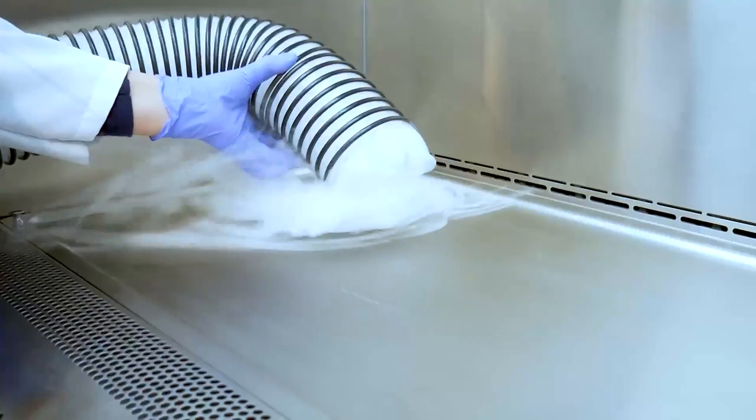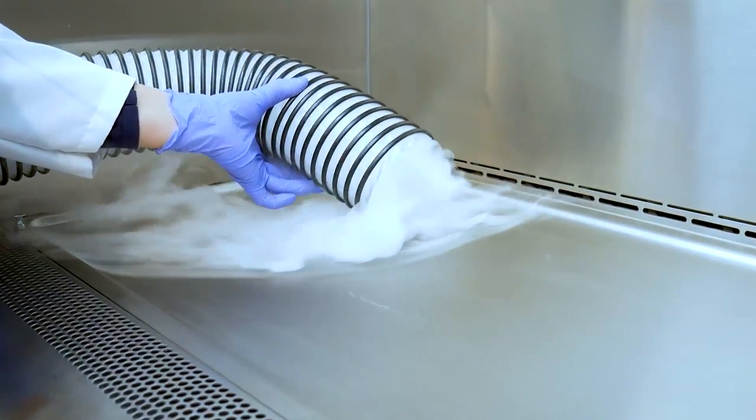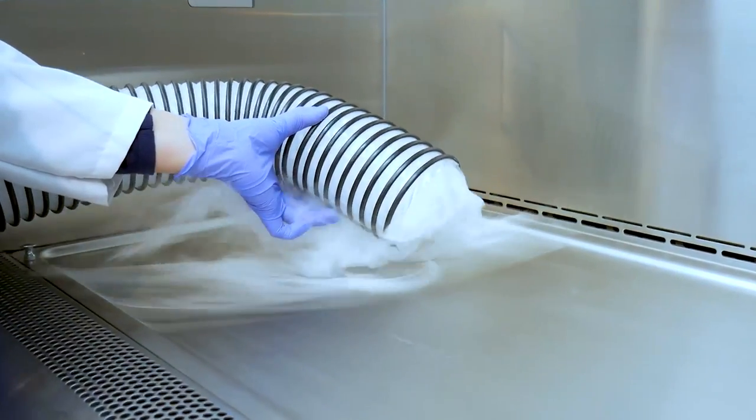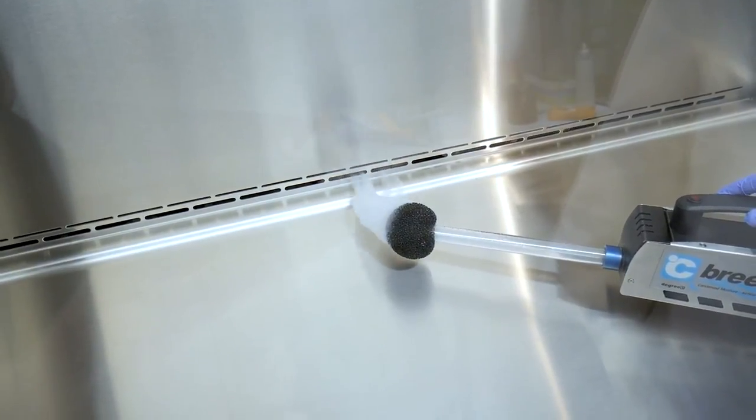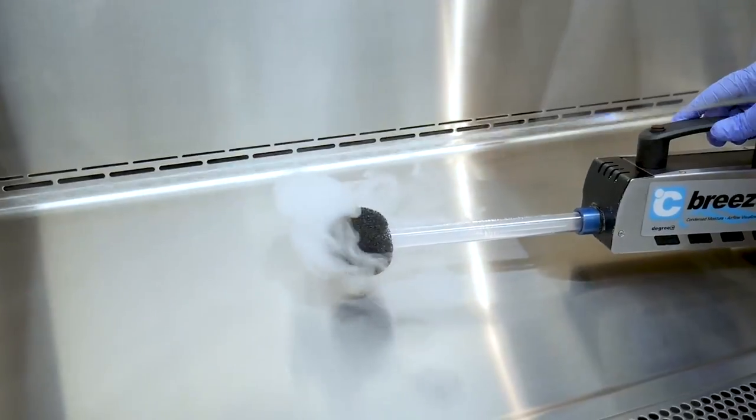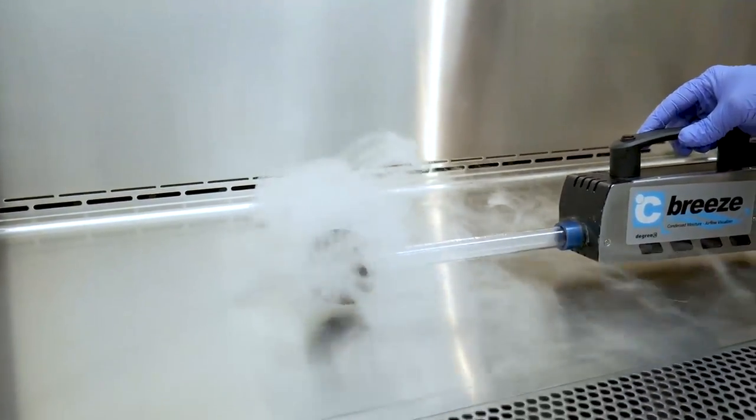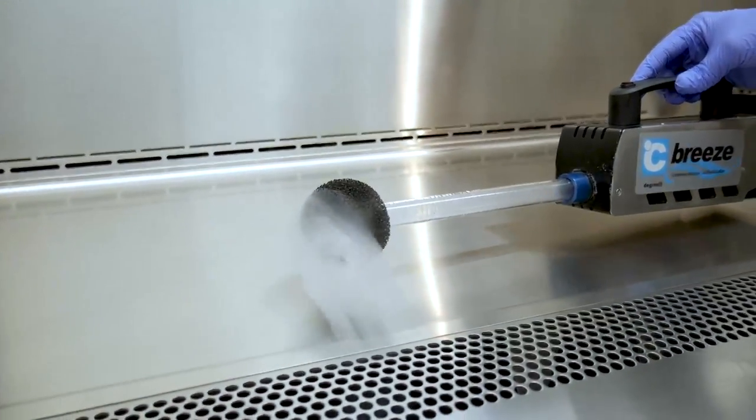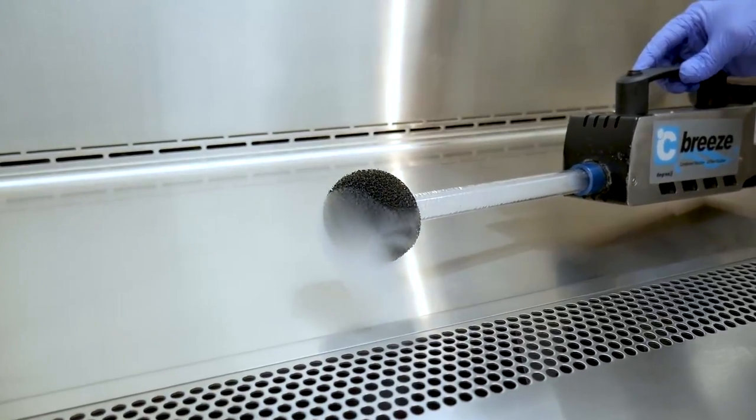As downflow air nears the cabinet's work surface, the airflow undergoes a phenomenon called smoke split, where a portion of the air flows to rear air slots and the remaining air flows to the front inlet grill. Higher risk activities should take place behind this line for maximum containment.